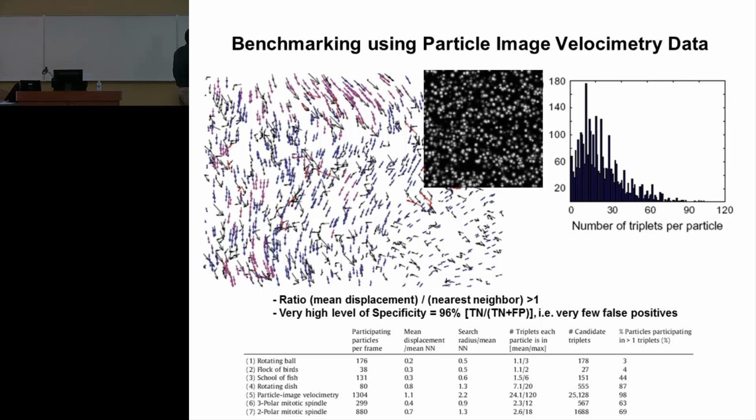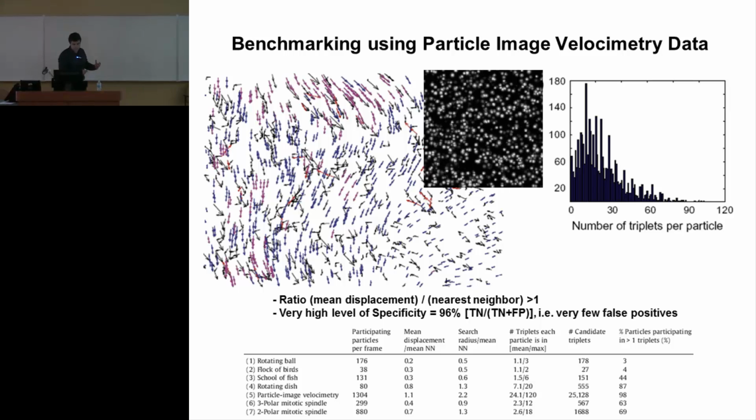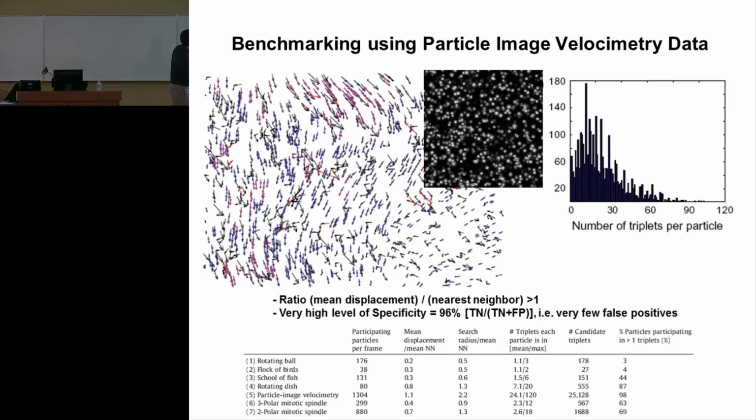We have three frames, and I perturb about 1/3 of the particles. Because basically the key of this algorithm is its ability to fish out the overall flow direction from noisy data. So we have a very high level of specificity and not so high level of sensitivity. So you see here, for example, when I'm plotting here, that we have competition.